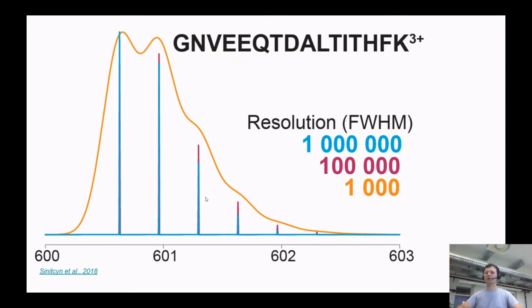No, it's not because of fragments. We are not coming to fragments yet. We are on the level of the peptide itself. Believe me, all these peaks are the same peptide sequence, but somehow we see not one peak but several peaks, and I will describe why. Imagine that on our planet we have 100% carbon, and the truth is that 99% of this carbon is carbon-12, but we also have a small portion, let's say 1%, of carbon-13.